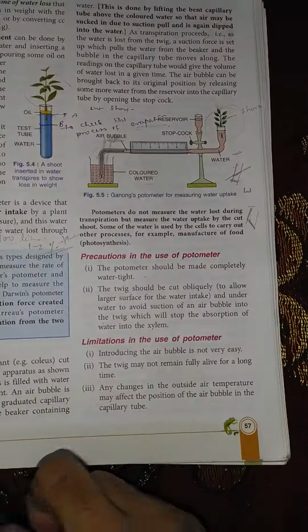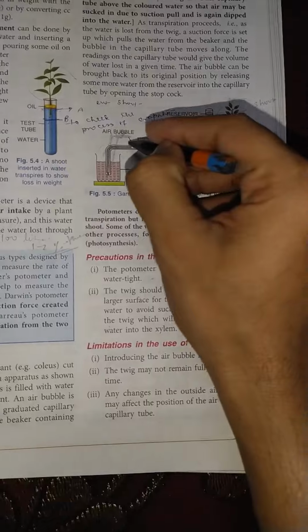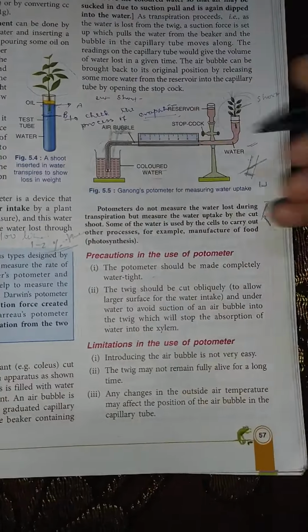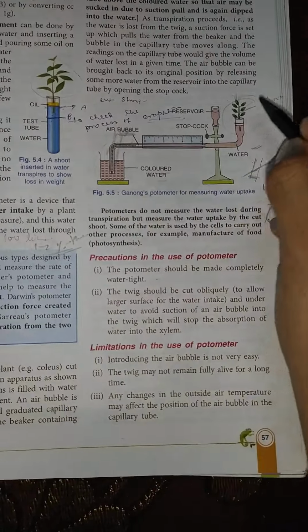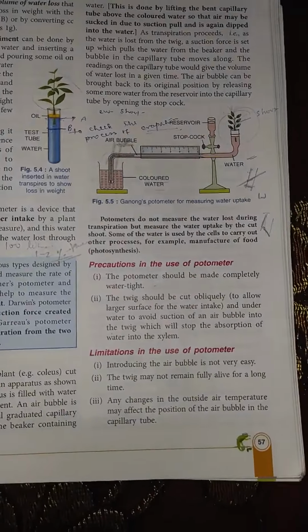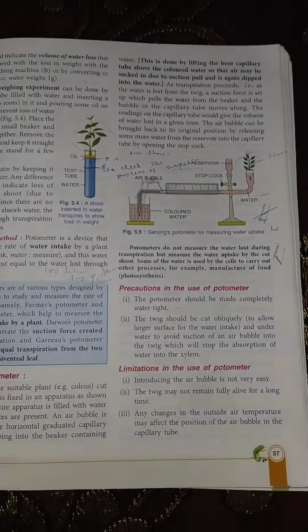Now any change in the outside temperature, since हम लोग जानते हैं सरफेस एवापोरेशन होता है. Just suppose यहाँ का टेम्परेचर ज्यादा हो गया, if the temperature outside of the capillary tube is more, what will happen, the water will start evaporating. सो उससे क्या हो जाएगा, तुम्हारा एक्सपेरिमेंटल सेटअप पूरा बर्बाद हो जाएगा.